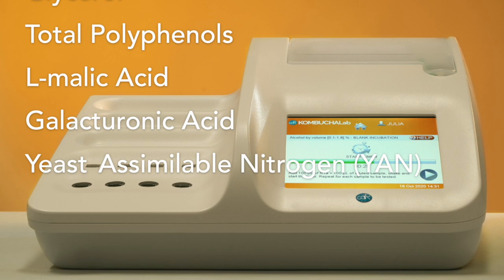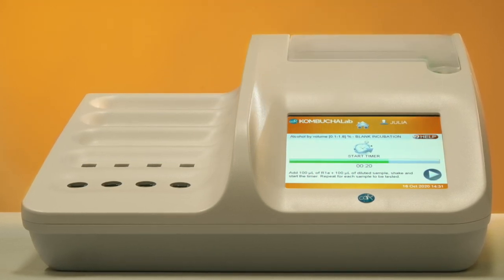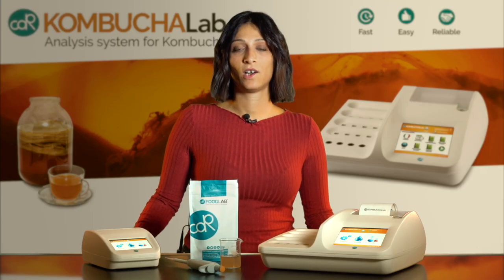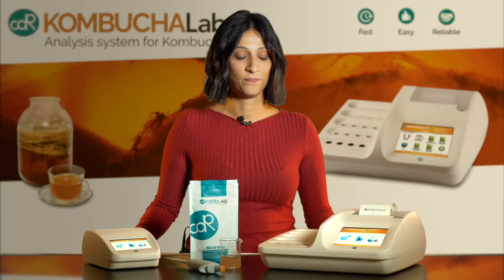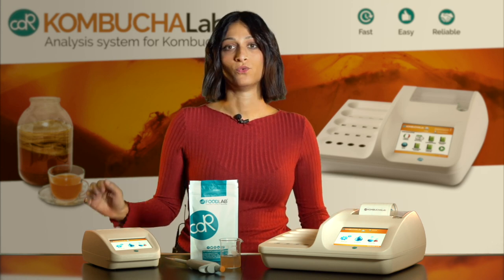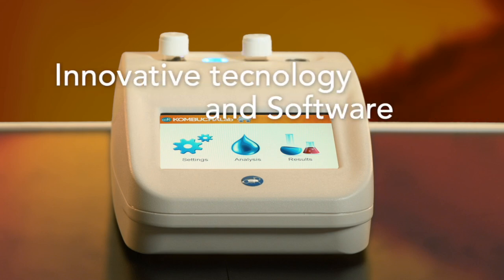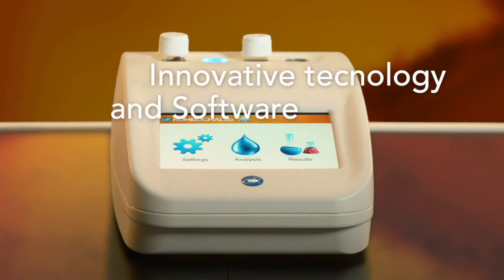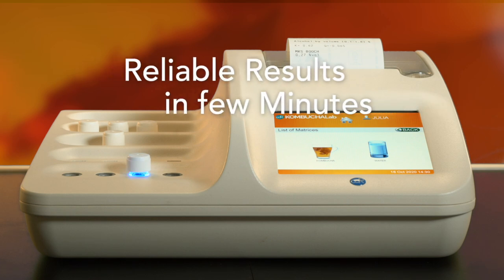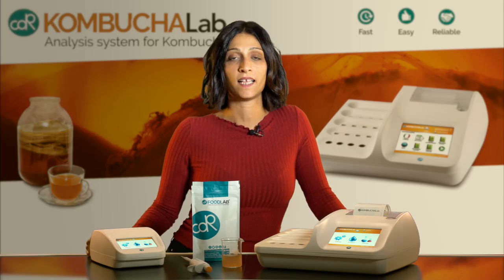There are two different models of CDR Kombucha Lab: the CDR Kombucha Lab and the CDR Kombucha Lab Junior, which is another great option. Both use innovative technology and software to enable reliable results in a few minutes, without the need of a scientific background.